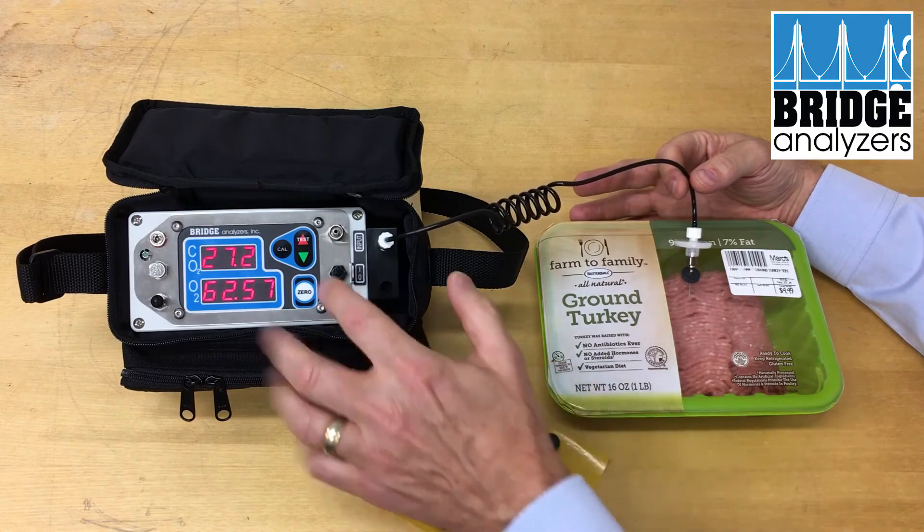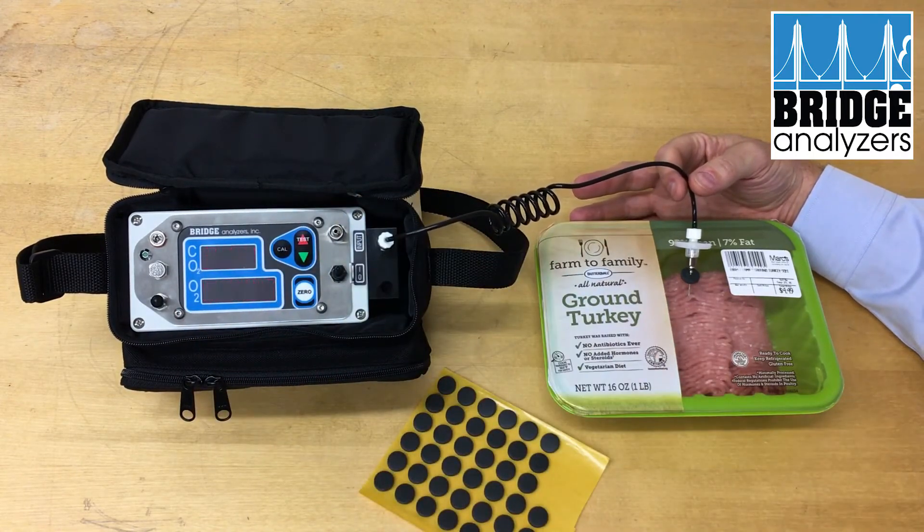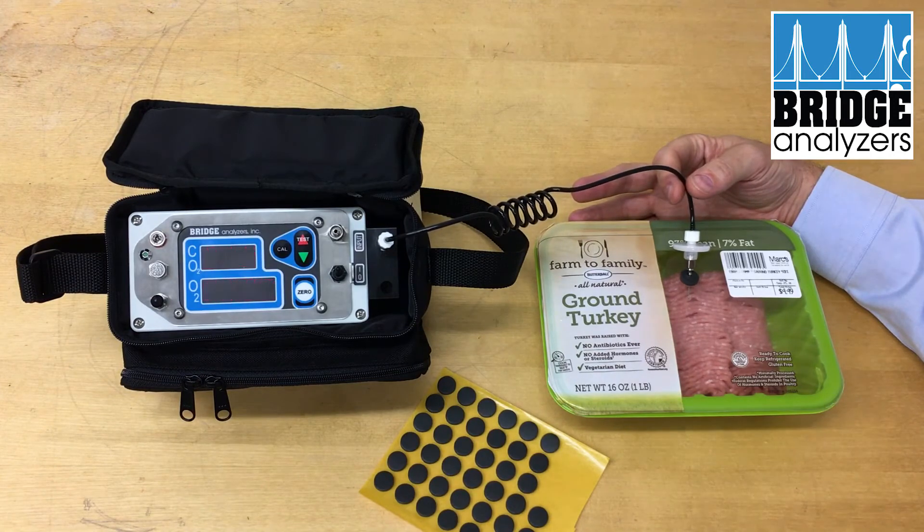If I wasn't sure about that, I could run a second test. Here again, it blinks while it's doing its testing and the pump is running. When it stops blinking and the pump turns off, the test is complete. There we have a completed test.